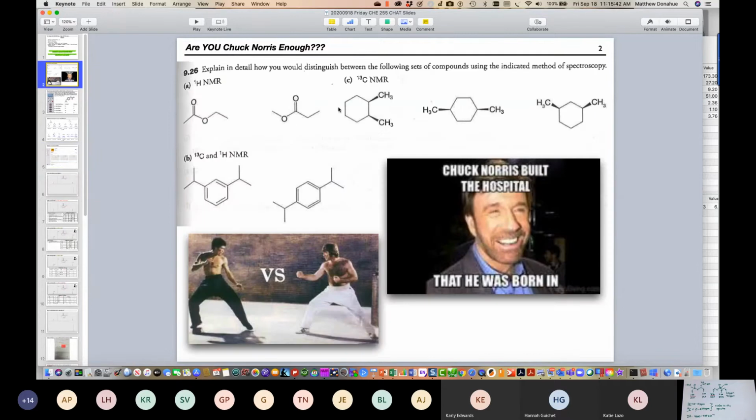So let's do this one here, part B, where you have to determine the unique C13 and unique NMR signals. So again, these are all constitutional isomers. For the one that my mouse is below, how many unique carbon signals would you see for this one where my mouse is circling now?